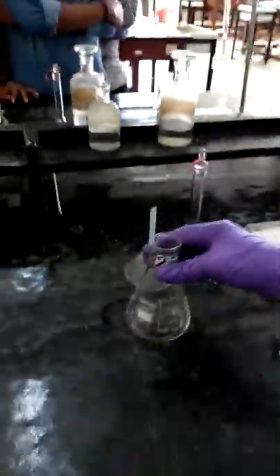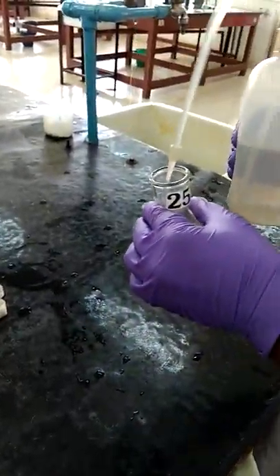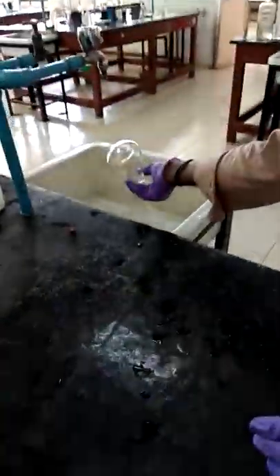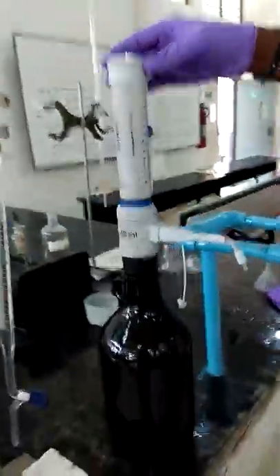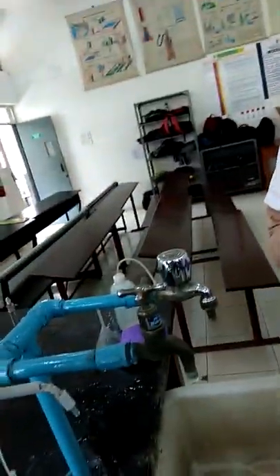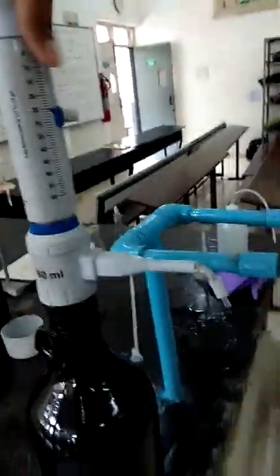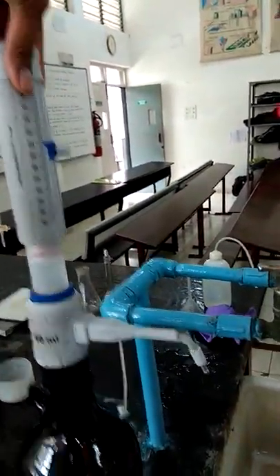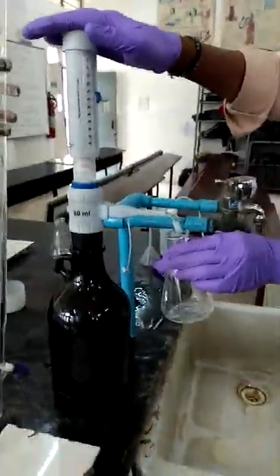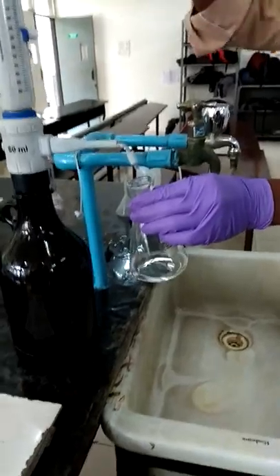Then take the conical flask for titration and clean it with distilled water first. Then remove that water. This is the dispenser bottle containing hard water. This has to be checked; it should be 25. First press this, then pull it to the maximum, then keep the conical flask and press it completely. Okay, this is 25 ml.